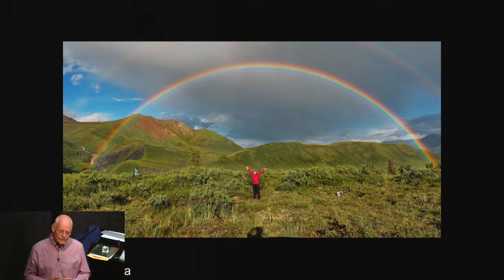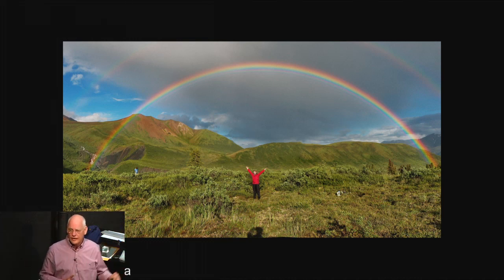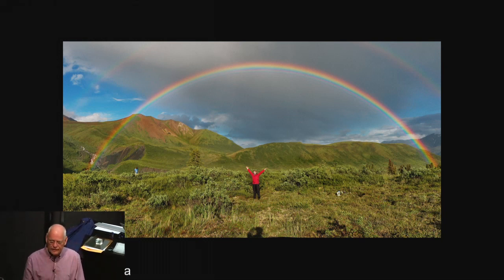Yeah, it's interesting. There is an effort right now regarding the type of imaging that I showed you, this polarized light, and also phase contrast or differential interference contrast, if some of you know these. They give you really structural information. They don't give you molecular information in terms of what kind of molecules.